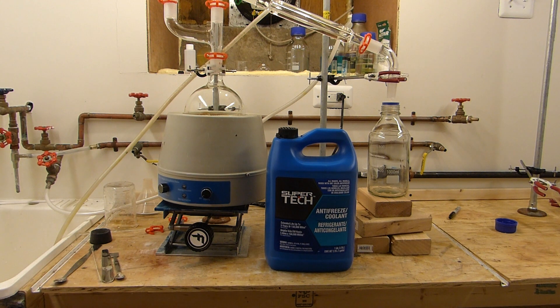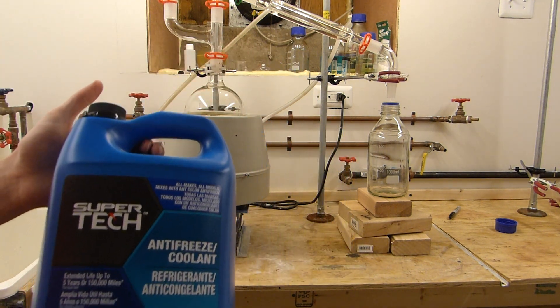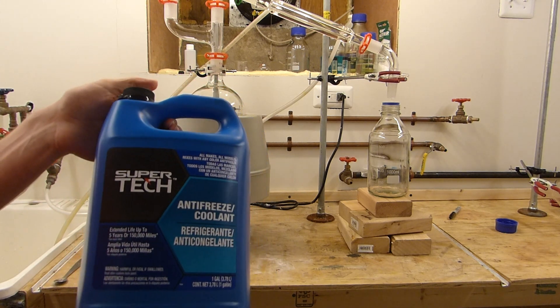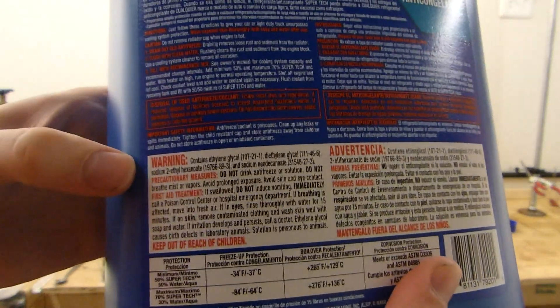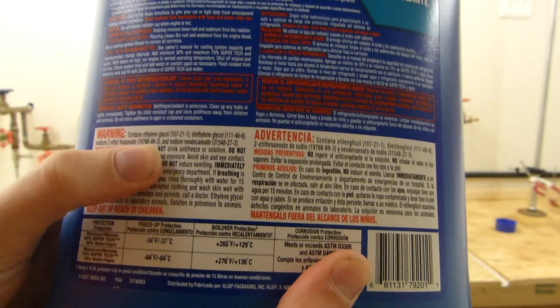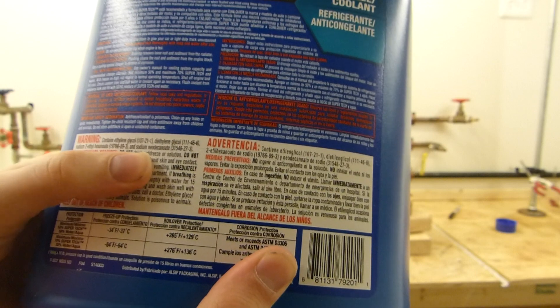The easiest way to get ethylene glycol is to simply look at the store for automotive antifreeze. Usually the cheaper stuff is the best to use. You want to get the undiluted antifreeze which doesn't contain water. If you look at the back here, the ingredients say it contains ethylene glycol, diethylene glycol, sodium-2-ethylhexanoate, and sodium neodecanoate.